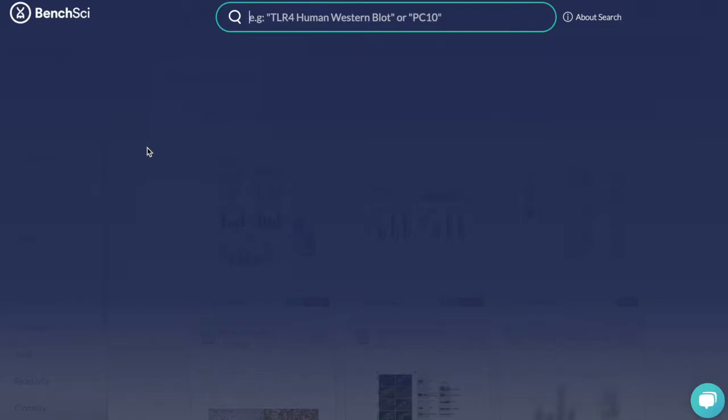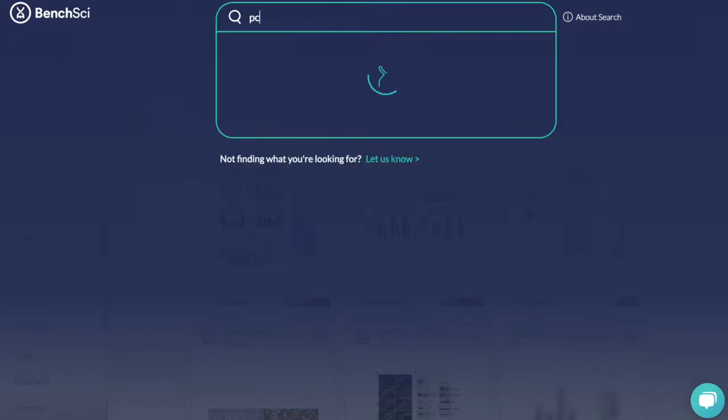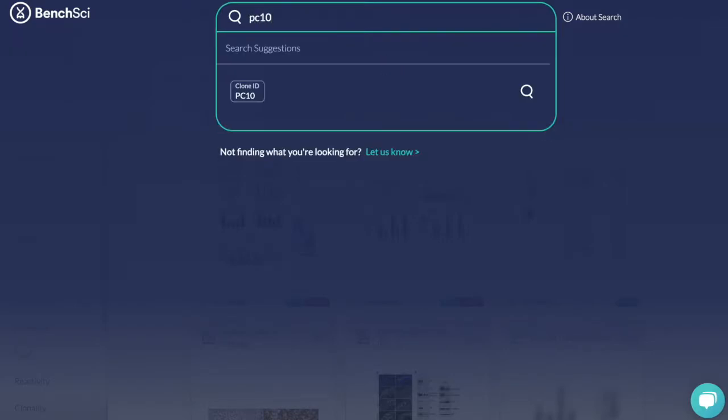If you want to find antibodies with a known clone ID, you can search for the clone ID by typing it directly into the search bar. For example, PC10 is a clone ID for a PCNA antibody. Then, select the result from the drop-down menu.